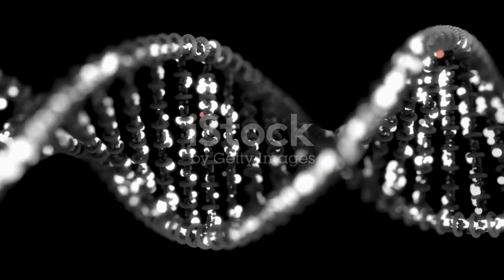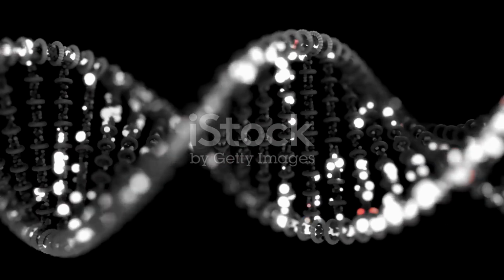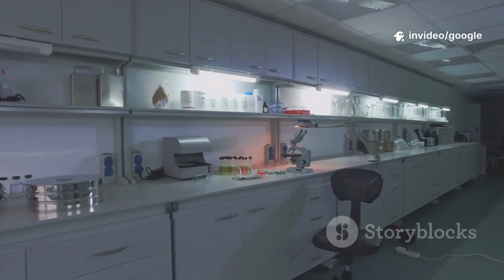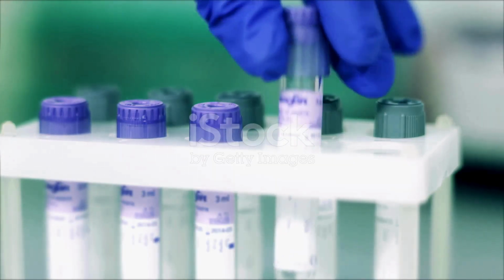However, using preformed RNP complexes is generally faster and can reduce off-target effects because the Cas9 and gRNA are only active for a limited time. 3. Assembling the CRISPR-Cas9 ribonucleoprotein, RNP complex, in vitro. This is the core step where the Cas9 protein and gRNA come together to form the active complex.